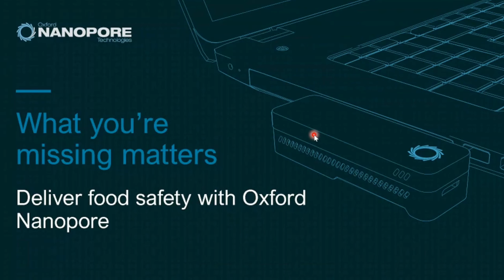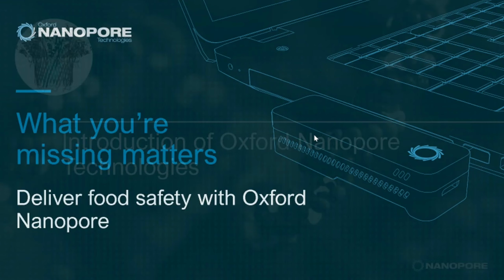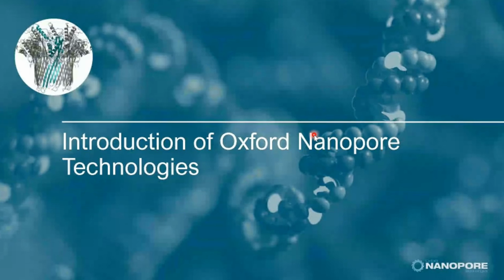Today I will be sharing on delivering food safety with Oxford Nanopore technologies. First off, I would like to begin with a short introduction on the manufacturer of the sequencing technology, which is Oxford Nanopore Technologies. After that, we will go to using this particular sequencing technology to perform food safety testing and applications for the detection of food pathogens as well as food authentication.